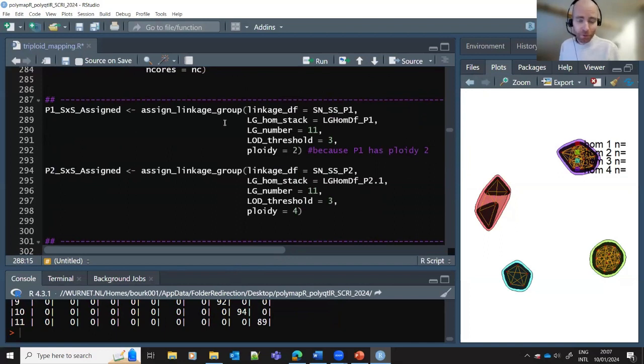This often happens also when we're running workshops and somebody says, why is this happening? And I'm looking at the error and saying, I have no idea why that's happening, but it's because they didn't do Control and Enter on one of these steps. So I just did it myself here.